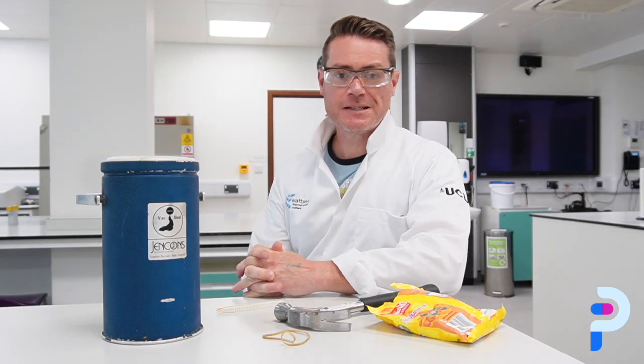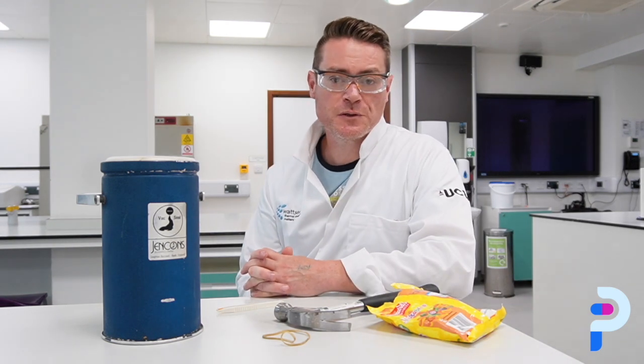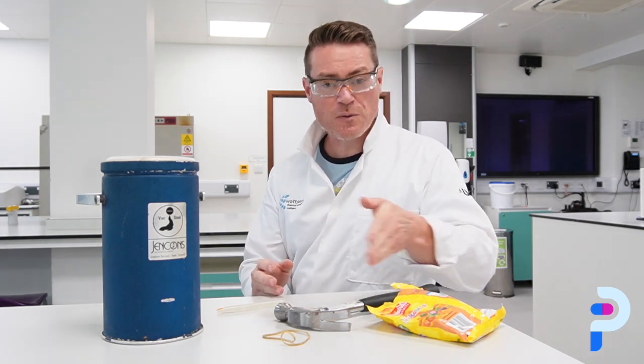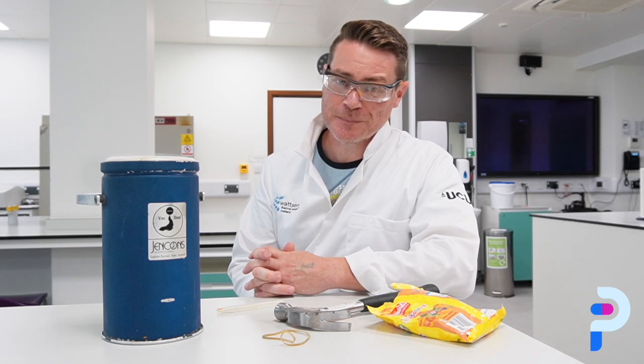Products. Today we're in my laboratory, and the reason is because I want to explain to you the basic principles of a glass transition, and in order to do that I need a couple of amorphous materials and some liquid nitrogen, and I can't do that at home.